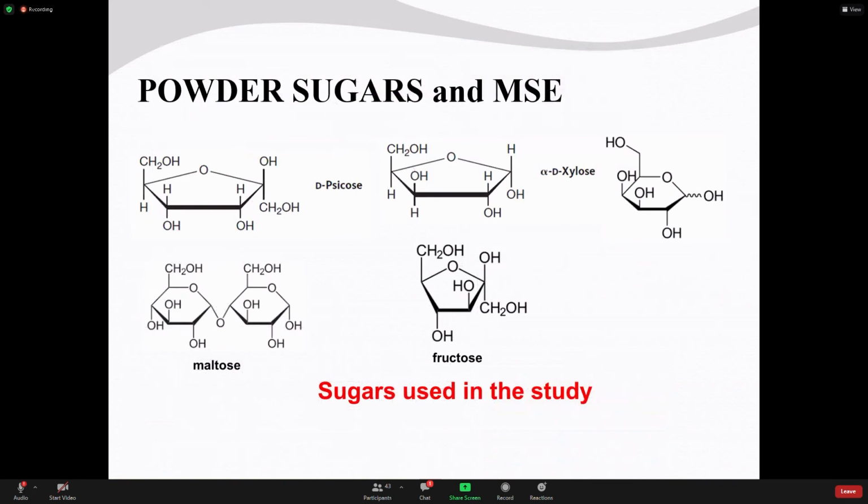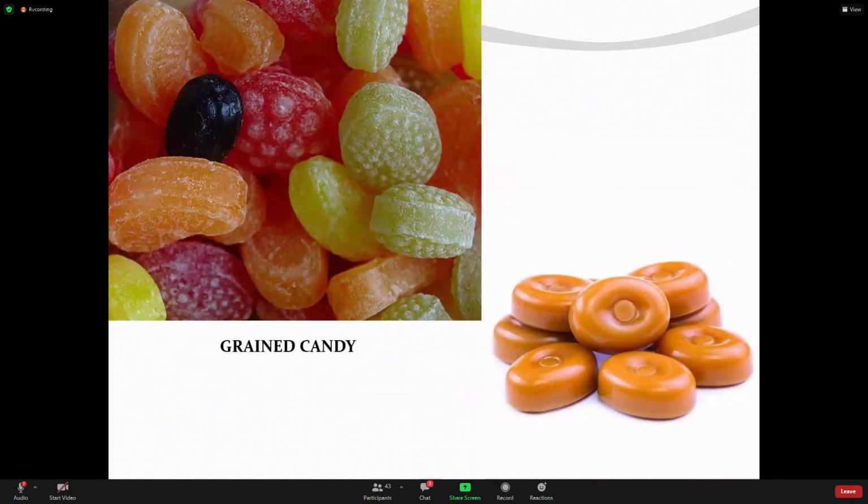We created simple crystalline and amorphous models. We freeze-dried the sugars to obtain amorphous forms, and we also used control crystalline forms, and we measured them by using this magic sandwich echo sequence. Well, the results were promising, and we are still working on that.